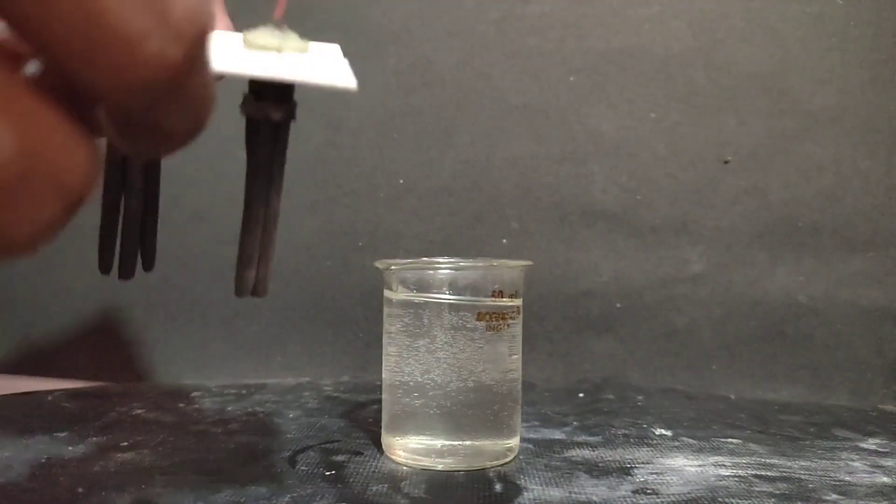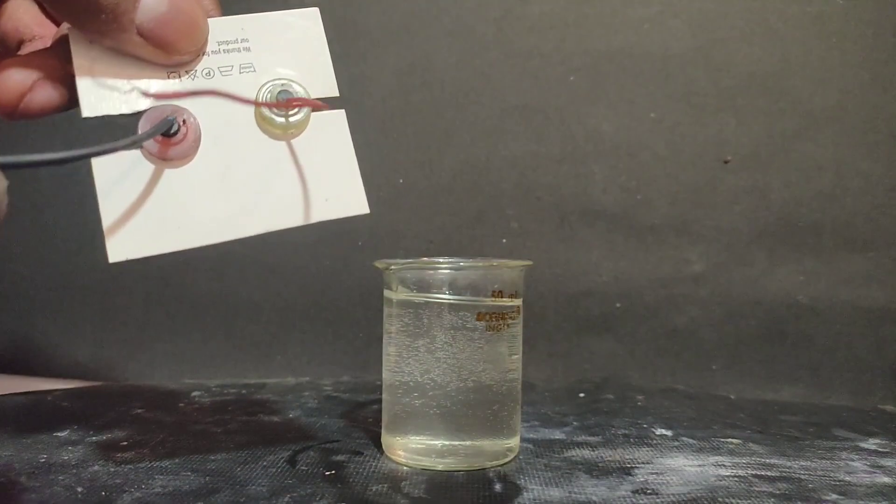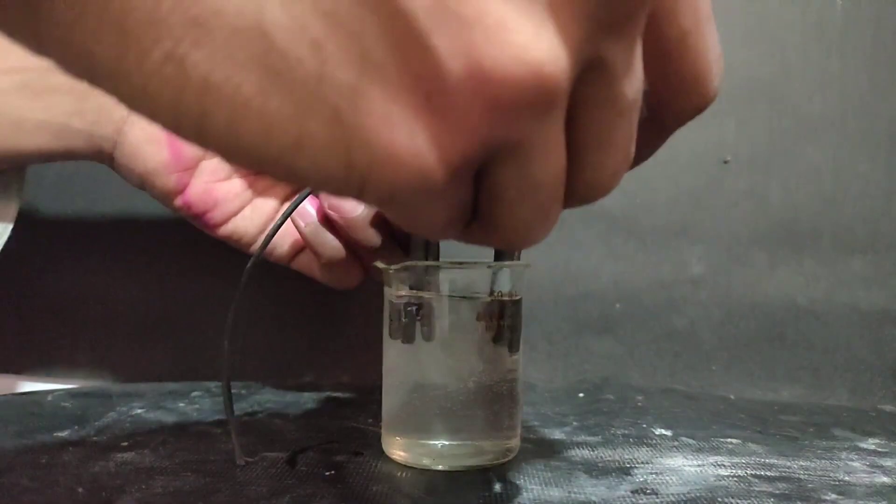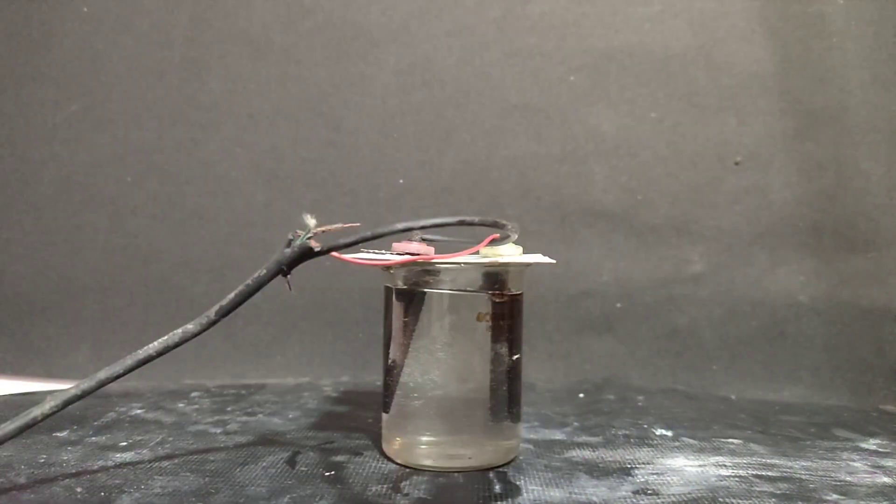Then I took my graphite electrodes and placed them in a card and placed the card over the beaker. I connected the electrodes to my 18 watt mobile charger.